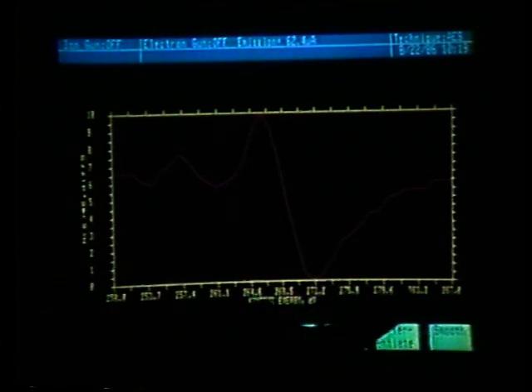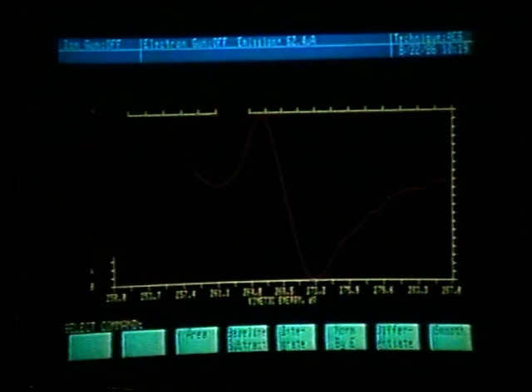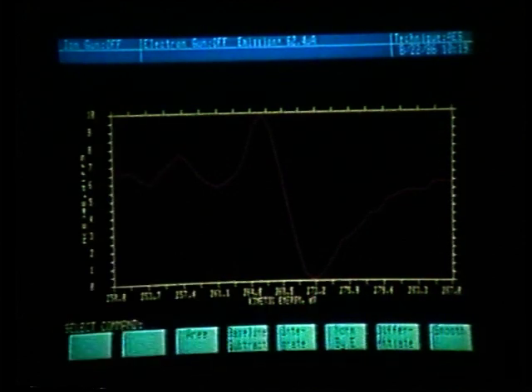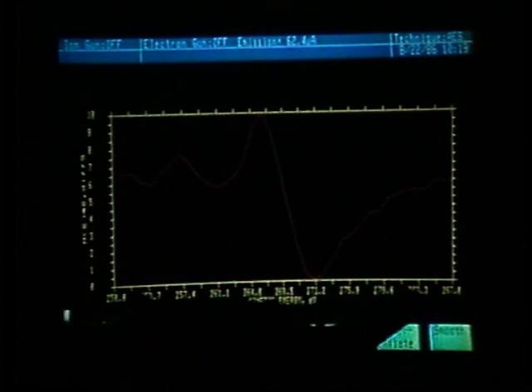Within this energy window, we see that if we ask for an atomic concentration, we indeed will be measuring the peak to peak height of the carbon peak itself and not an adjacent peak. This is important to determine because when we ask for an atomic concentration, we could also define a new window within this window.